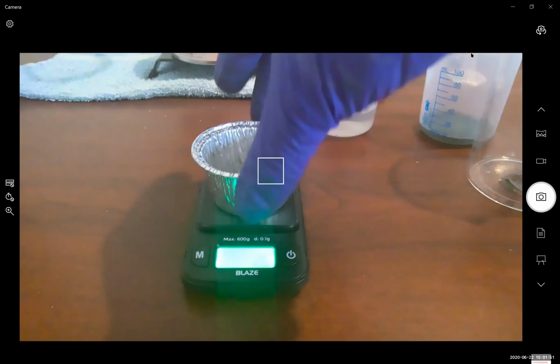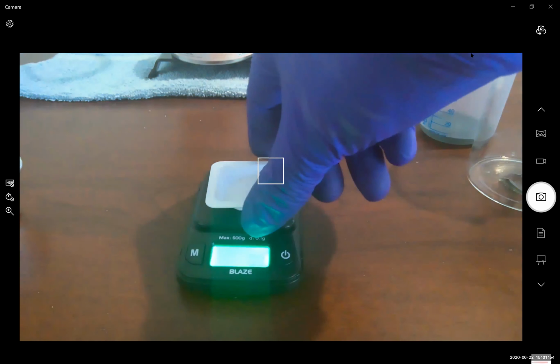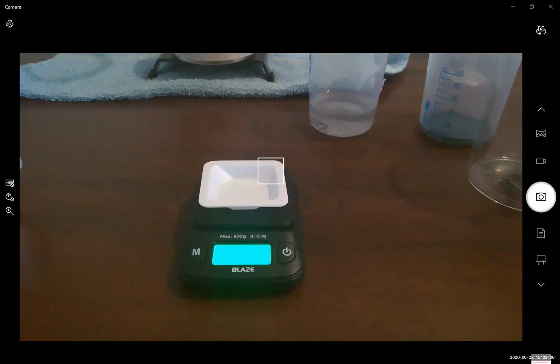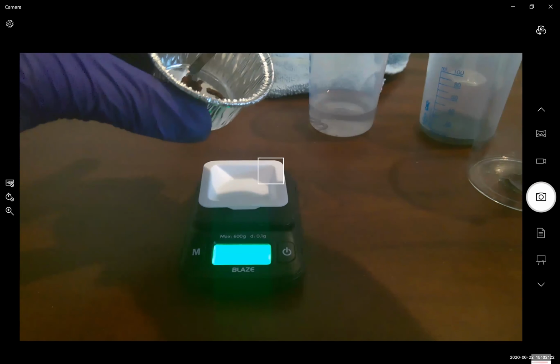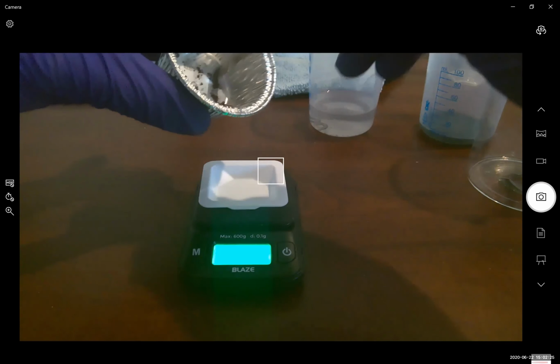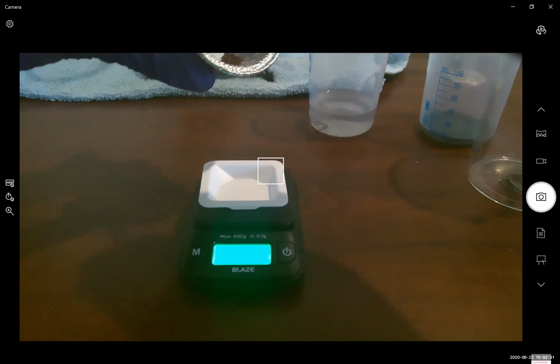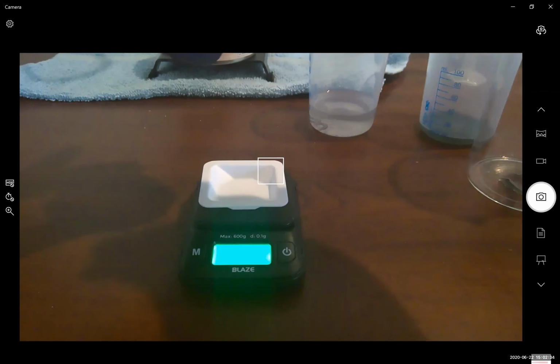Now, what we're going to do is take a tared weigh boat and transfer our solid copper to the weigh boat so that way we can take a little picture. While we're here, we might as well take another mass measurement just for completeness. So let's scrape our copper. We actually made a fair amount of it. It's good. And it should be bone dry if you've done everything correctly up to this point.